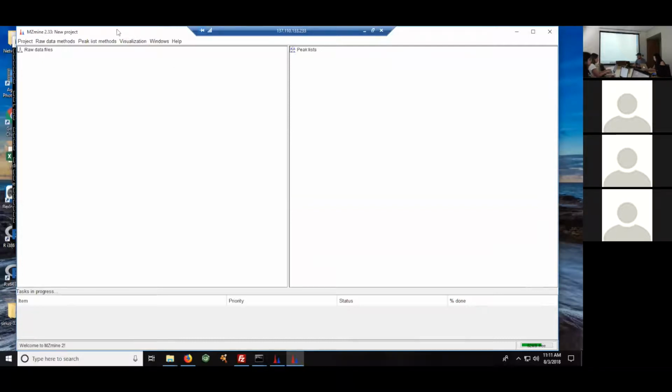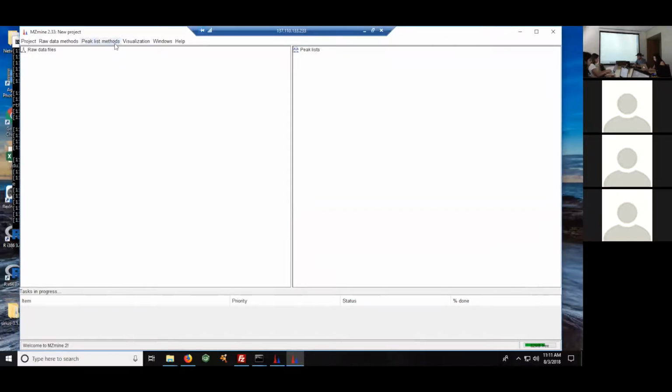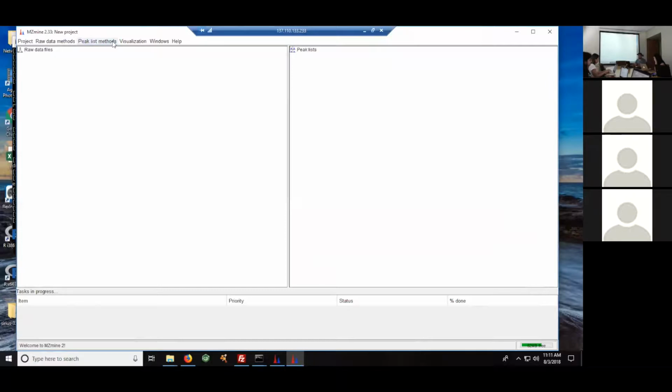But I think for educational purposes, it's good to go through step by step, especially if you're not sure about the parameters, because there are a lot of graphical possibilities to assess the processing you did. So hence, I would just say let's go through this manually. And if you want to redo this later, you can also use the batch file. I just showed you the location.